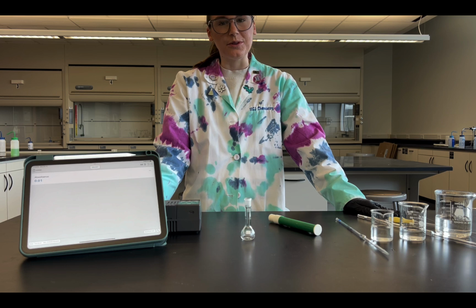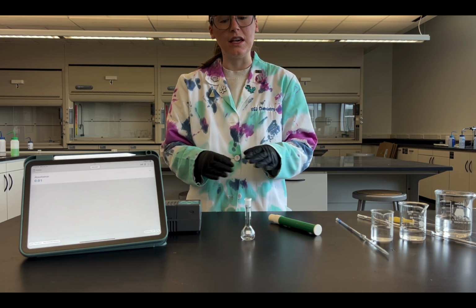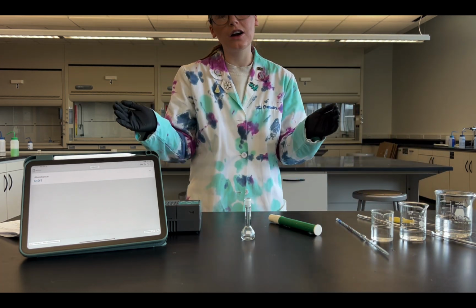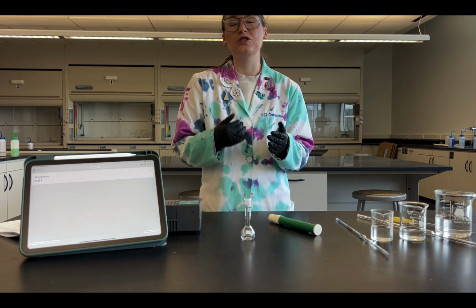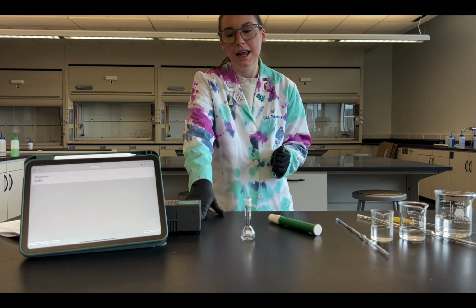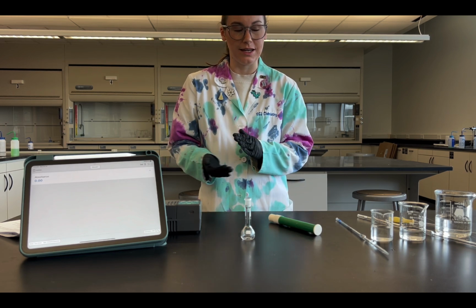So now that we know where those absorbance values are coming from and how we can use those to form our standard curve and to find our y equals mx plus b equation, our second part of our lab has us doing slightly different dilutions in order to adjust where our equilibrium lies. Essentially, we are going to use the information about our initial concentrations of our solutions as well as our absorbance to find an equilibrium concentration, and we are going to use that to calculate K for this given reaction of iron mixing with thiocyanate being in equilibrium with iron thiocyanate.